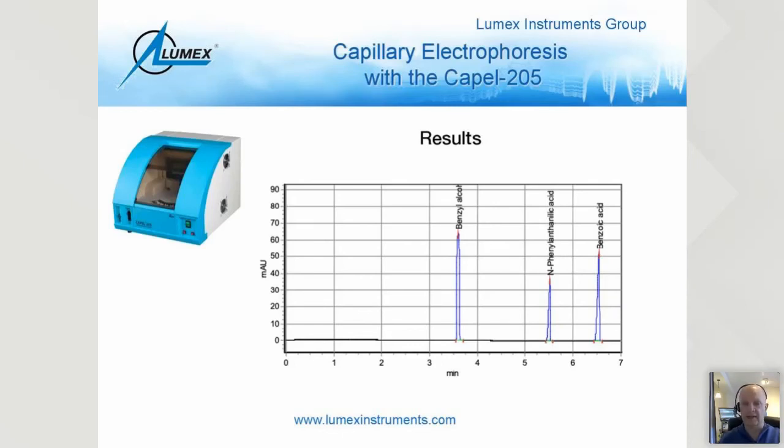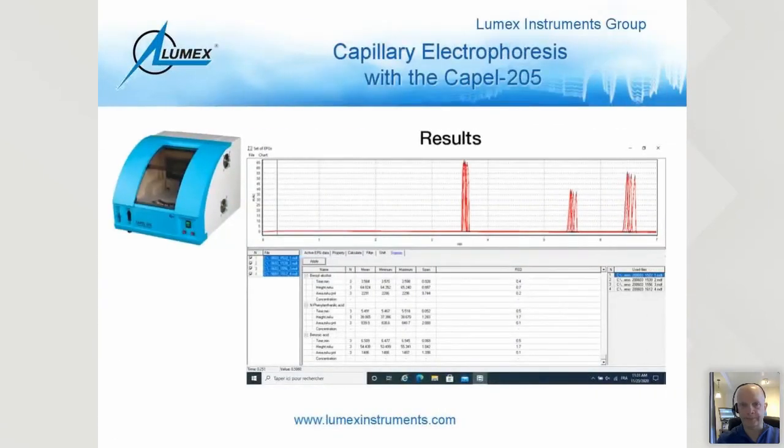And of course, the statistical analyses as well, which I'm going to jump into right here. Let's click right there. This is becoming more and more important for people that are writing papers, because a lot of people are being asked, well, how reproducible is this? Well, here you go. And one quick way you can show this report to say, well, this is how reproducible this is. So that's really great.